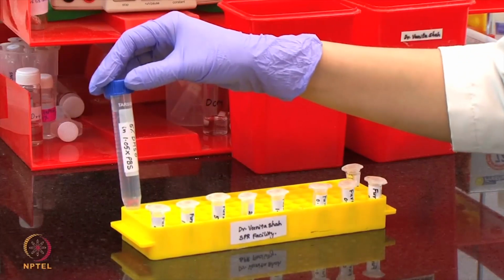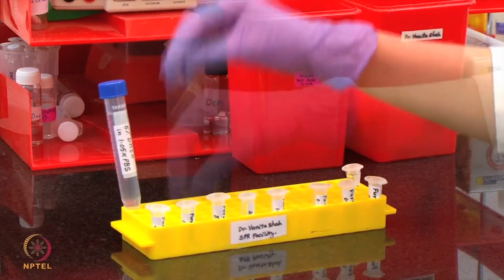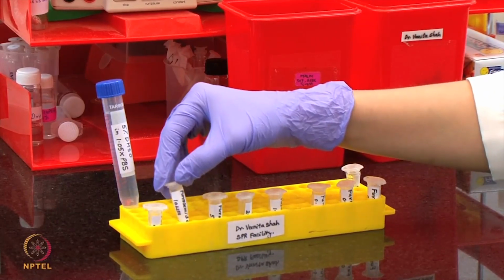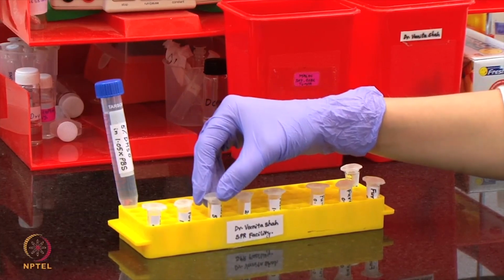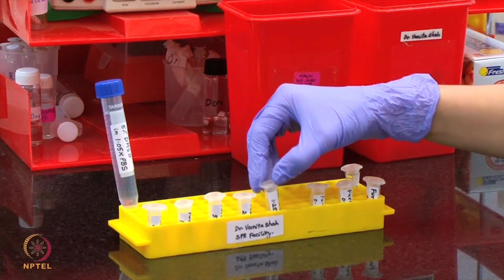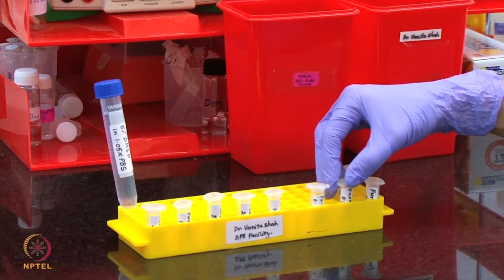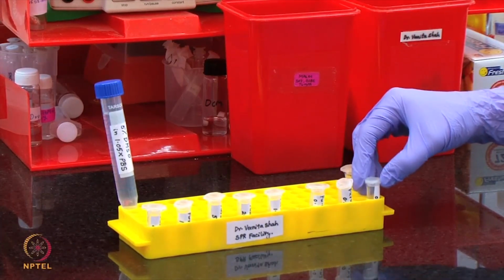We will be using 8 different concentrations of the analyte furosemide in the running buffer, including 20 micromolar, 10 micromolar, 5 micromolar, 2.5 micromolar, 1.25 micromolar, 0.625 micromolar, 0.312 micromolar and 0.156 micromolar.